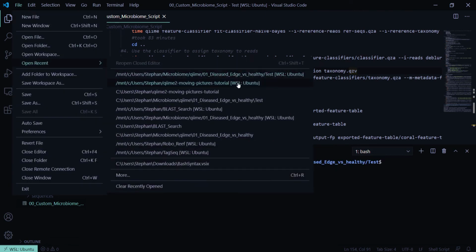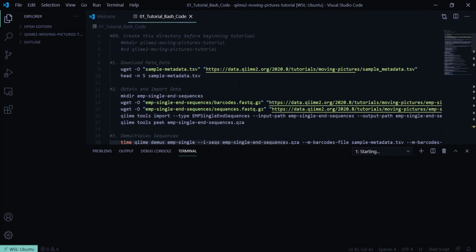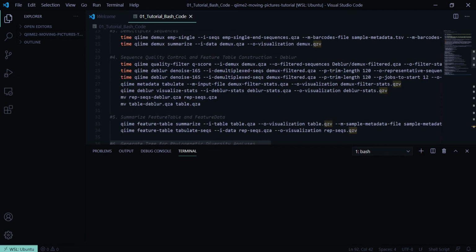Nope. I suppose maybe it's this one. Yep, okay, this is it.